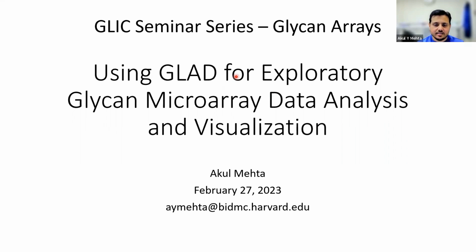microarray data analysis. Here's my email address, aymehta@bidmc.harvard.edu. In case anybody has any questions, I will leave it in the chat at the end of the talk for anybody who wants to get in touch. And then there are just a few slides and then we'll move to a live demo, because I think seeing the software work in real life will probably help more people understand how they can use GLAD for their own applications.